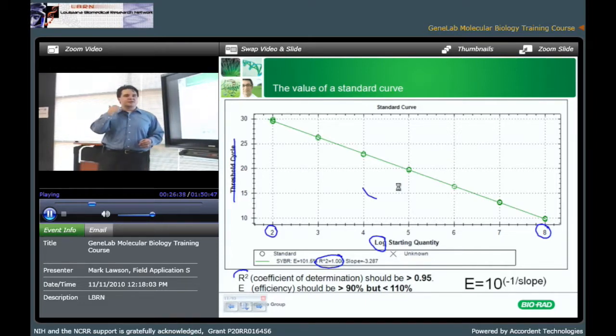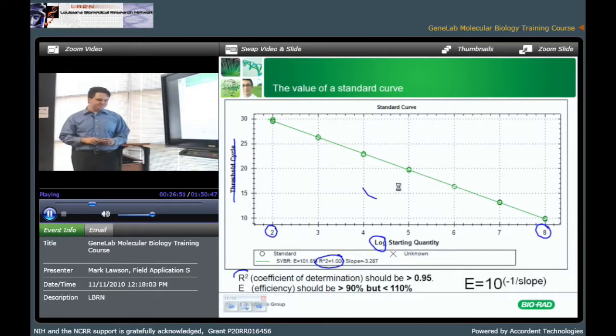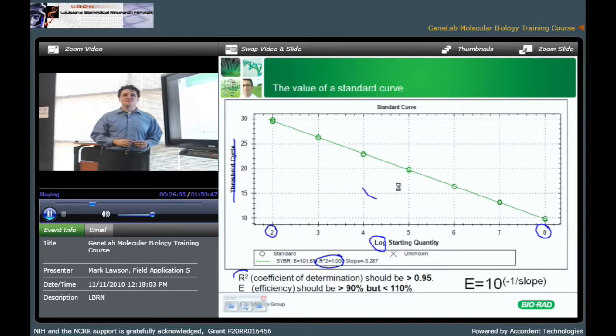And every once in a while, we get a phone call. People want to know if they've hit 200% efficiency, if they should call the Nobel Committee or wait for the Nobel Committee to call them. We have to break the bad news to them. 200% efficiency is just as bad, if not worse, than, say, 30% efficiency. Now, some of you that have done real-time probably know what the most common cause of ultra-high efficiencies is. Anybody?